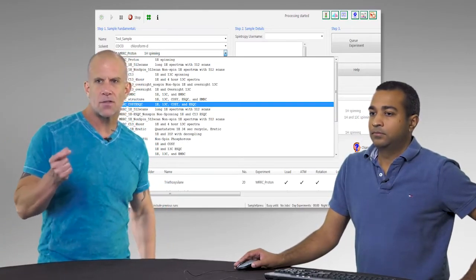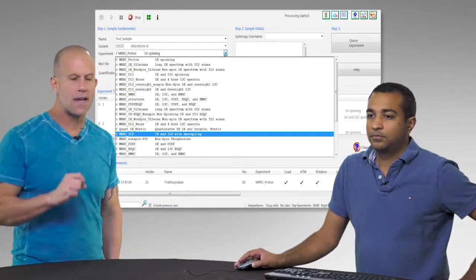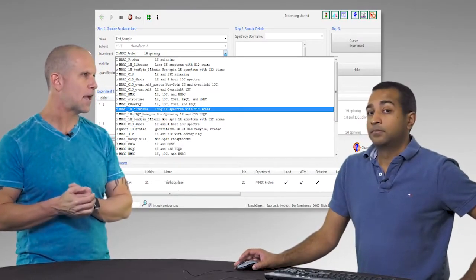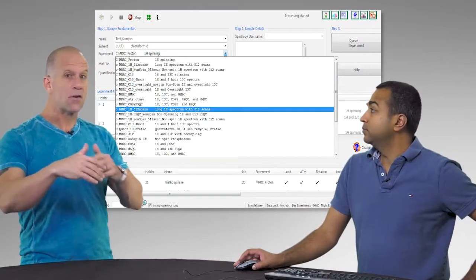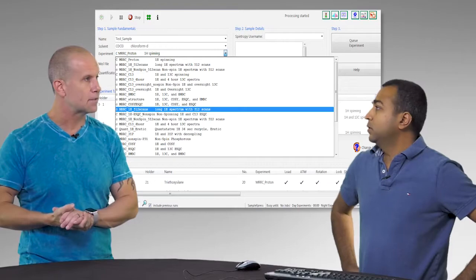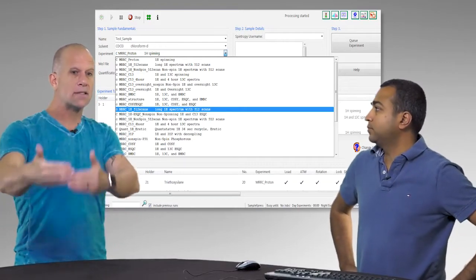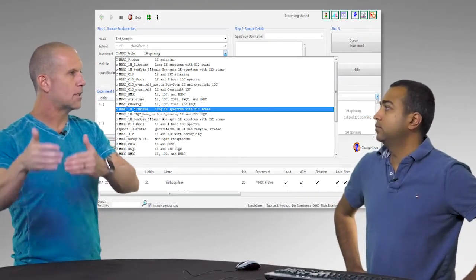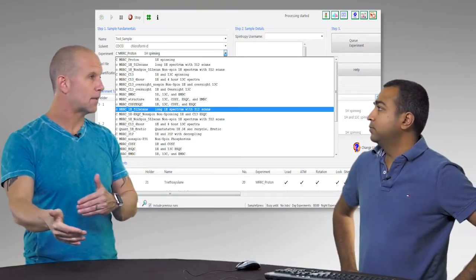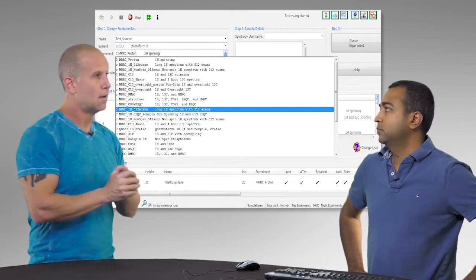Now, it also says some are overnight. The queue is sophisticated enough that if you're not running one of the simple, quick experiments that only take a few minutes, and you're running something that's going to take multiple hours, it won't run it even if you queue it up during the middle of the day. It won't run until that night.